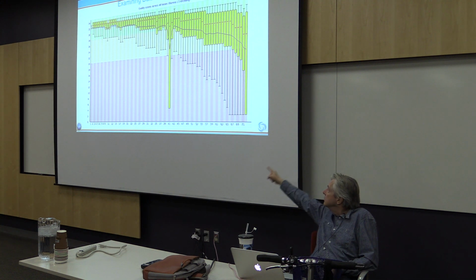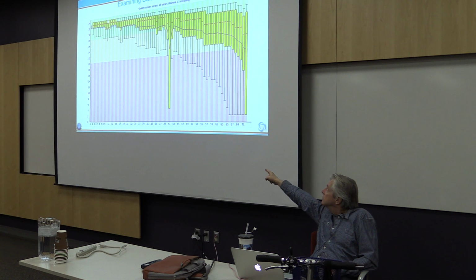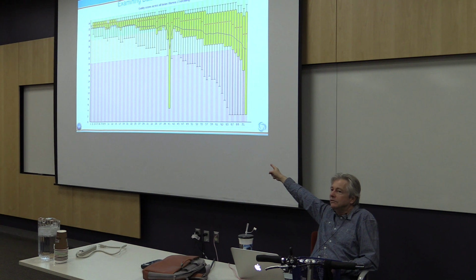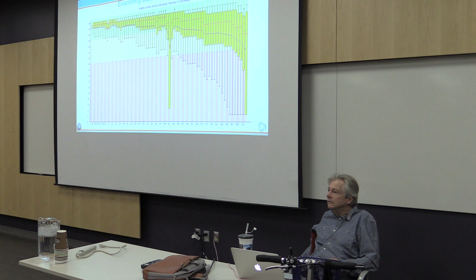And this is an example for a read, I think, where reads are 72 bases long typically. And you can see that quality tends to go down at the end. This was, I think, one of my files, and something happened during the sequencing process, and that wasn't my fault, but look, the bottom fell out of the signal right at about 41 bases in.